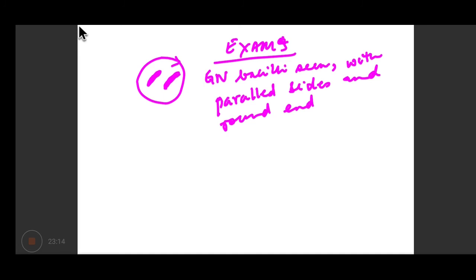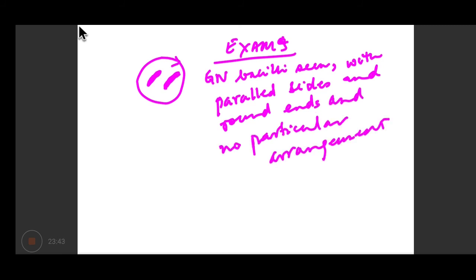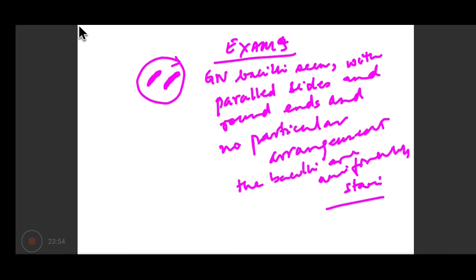Because तुम लोगों को exam में you will mostly get members of the Enterobacteriaceae family, ranging from E. coli to Klebsiella, Pseudomonas, Salmonella, या Shigella. So they have this very constant structure on gram stains, so you can use this statement everywhere. Rounded ends and no particular arrangement. The bacilli are uniformly stained. Each word in this sentence has got a huge importance.